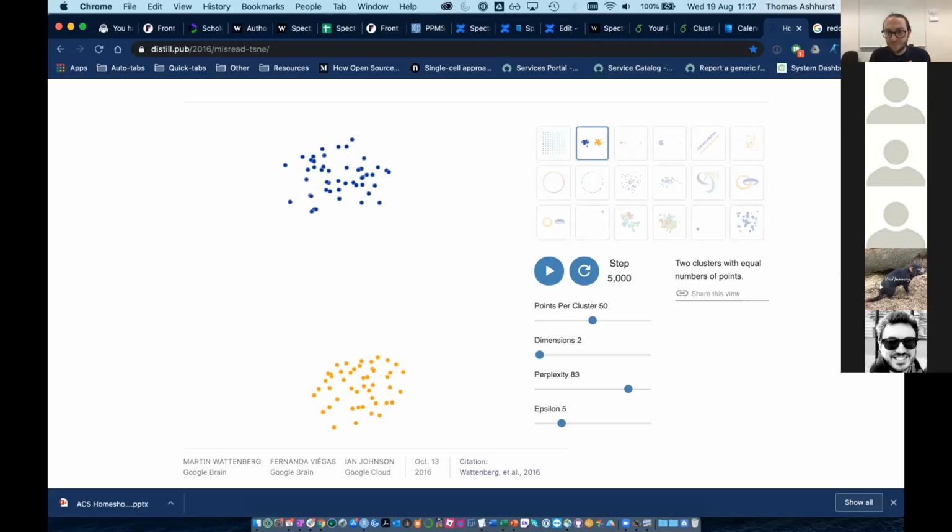Oh, yeah, actually, I'll just deal with Laura's question first. Sorry. t-SNE's default is a perplexity of 30, which tends to work for most cytometry data sets. There's a whole storyline behind why that is, but it's essentially the performance has got a fairly shallow curve there. And for the type of data we have with the number of features we often have in cytometry data sets, a perplexity of 30 just happens to be suitable most of the time.